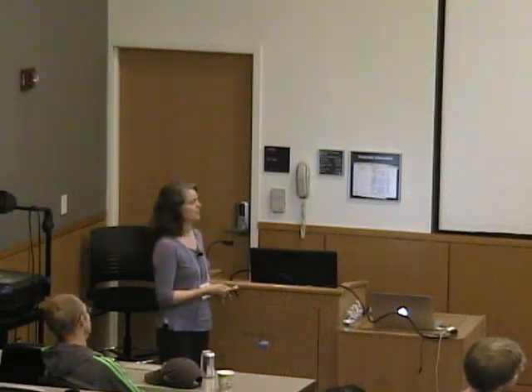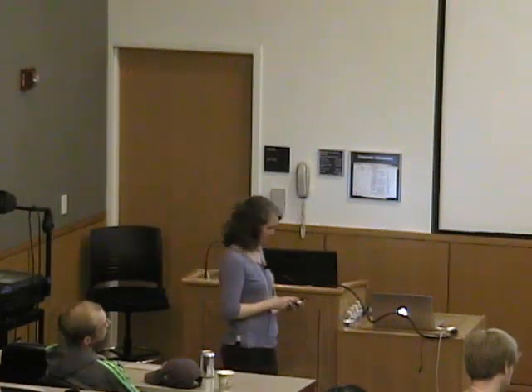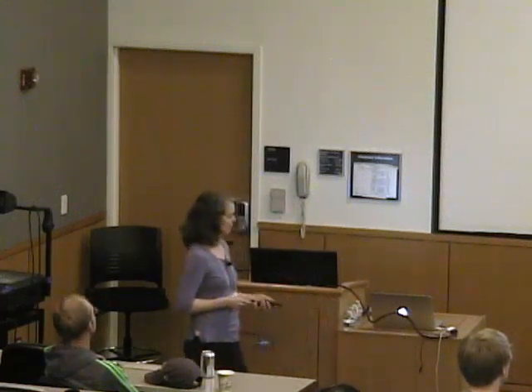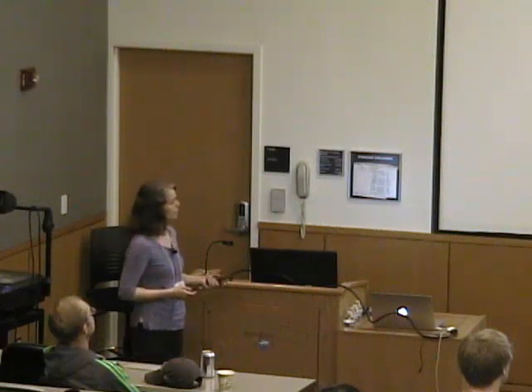I spent some time talking about relaxation to emphasize the importance of the electron spin relaxation time in determining the amount of line broadening that you have. And that is something that you can have some control of, at least in terms of picking a particular system and particular spin oxidation state. And then magnetic anisotropy determines the magnitude of the pseudo-contact shifts.